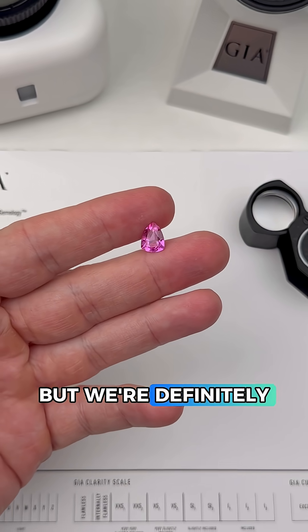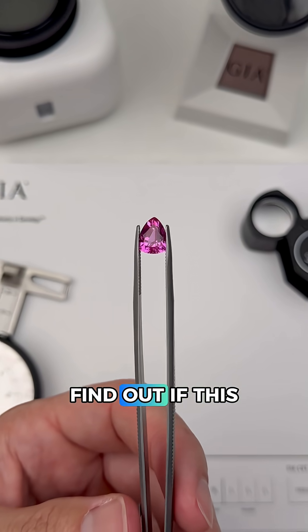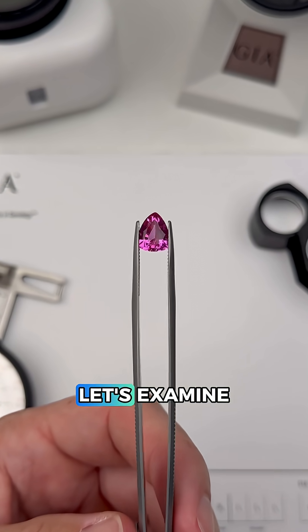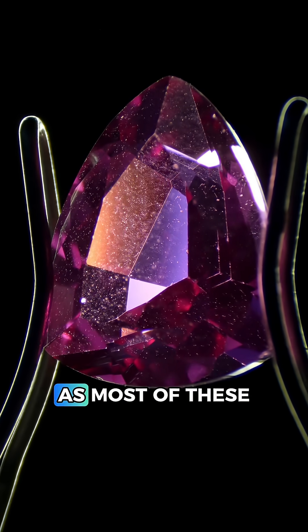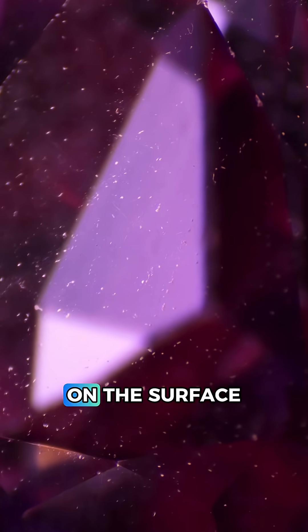This is looking like pink sapphire, but we're definitely not done yet because we need to find out if this is natural or synthetic. So let's examine the inclusions. This gem is extremely clean on the inside, as most of these specks are just dust particles on the surface.